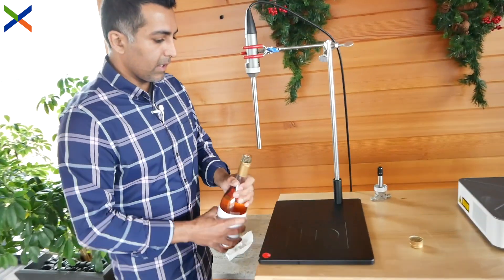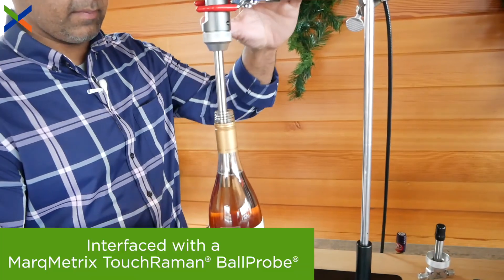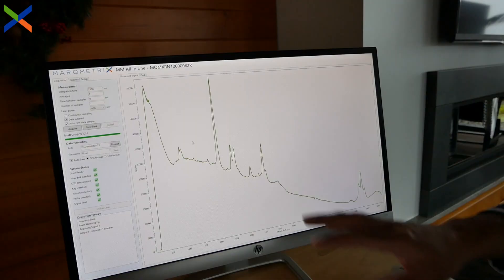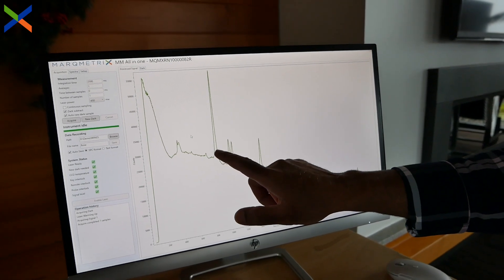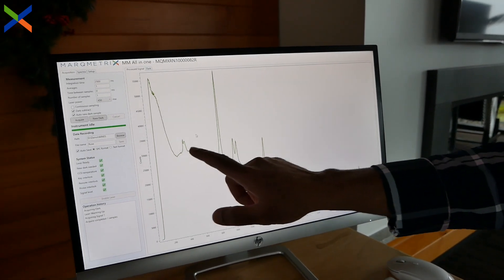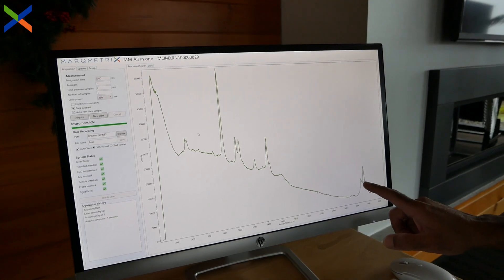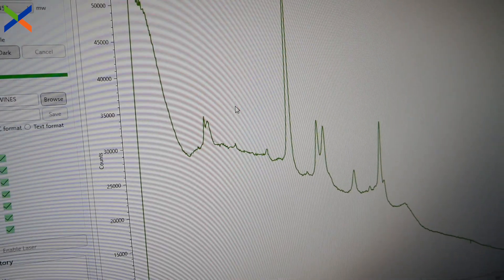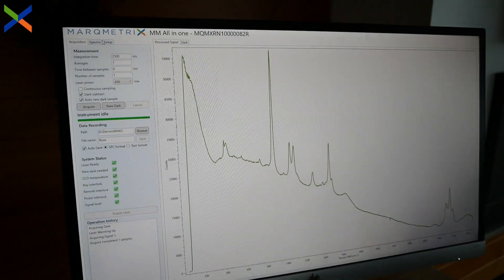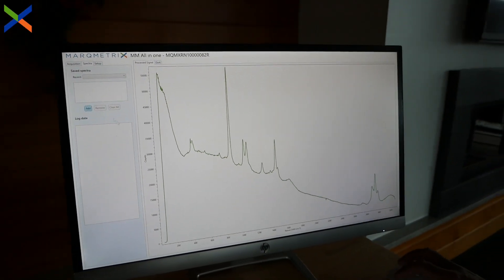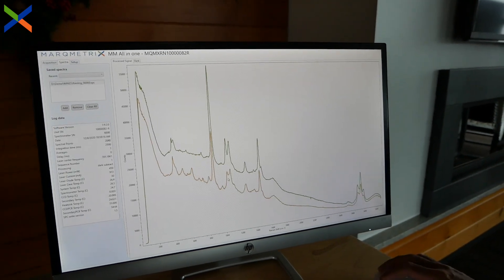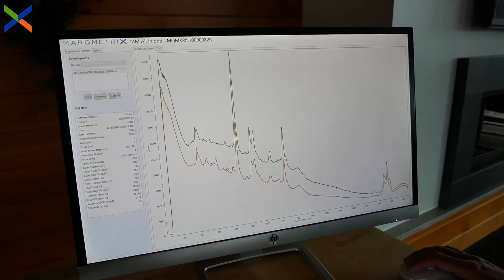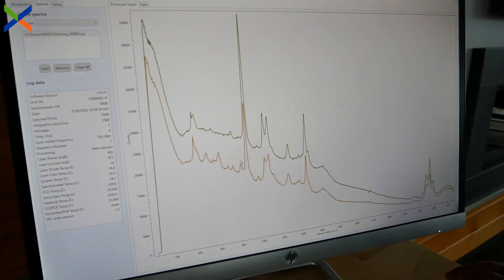Just like the previous wines, we insert the probe into the bottle of wine. Again, the peaks you see here come directly from the alcohol content in the wine, with very little amounts of sugar. Let's go ahead and overlay the spectrum of our sweetest wine, the Riesling — and you can see the peaks that belong to the sugars that are missing in the rosé.